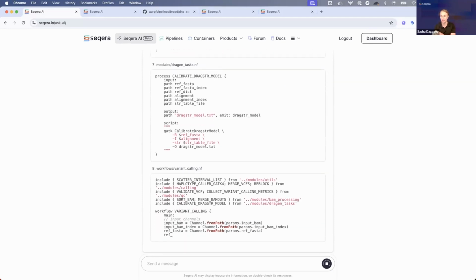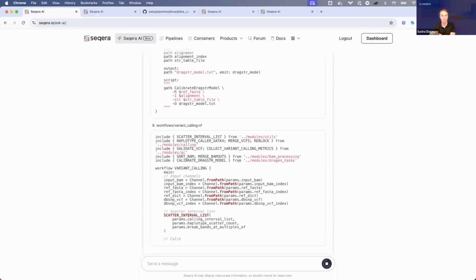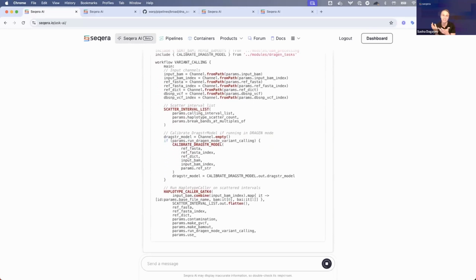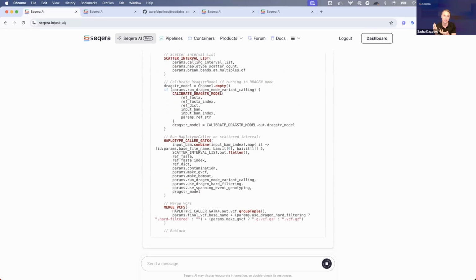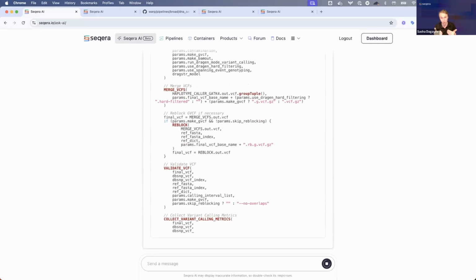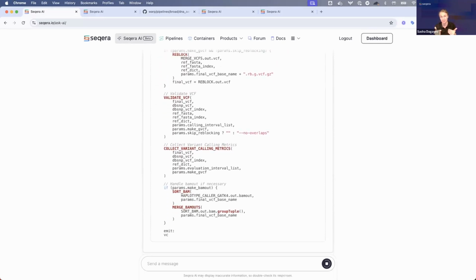The second difference is that you'll see that this code is actually fairly modular, right? This is, again, a stylistic choice that we made with this chat experience.